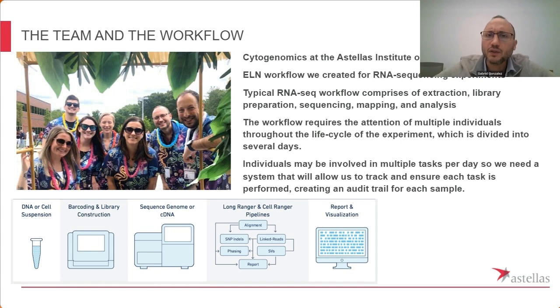A typical RNA sequencing experiment comprises the extraction of the RNA, then the library preparation, sequencing, mapping, and then at the end of the run is the analysis part.